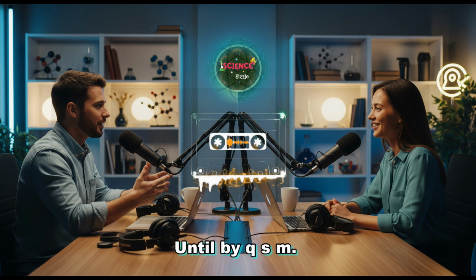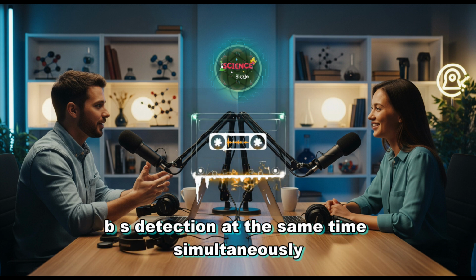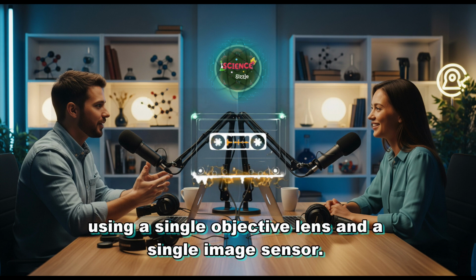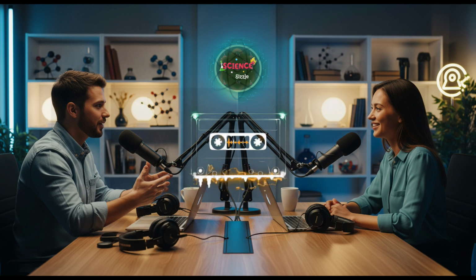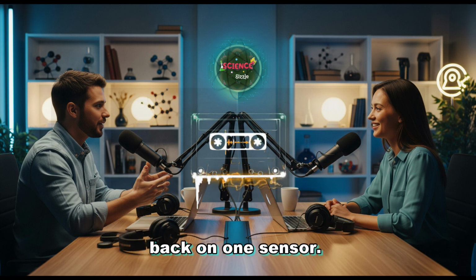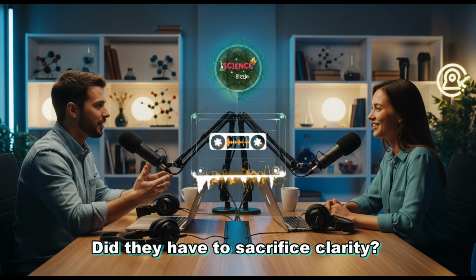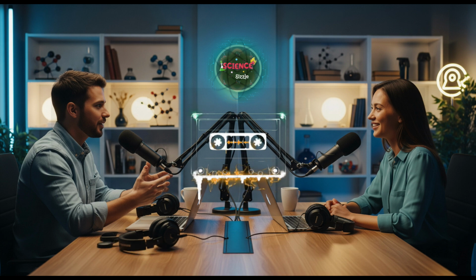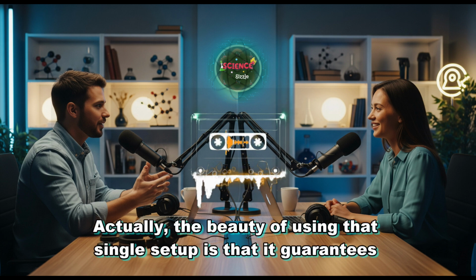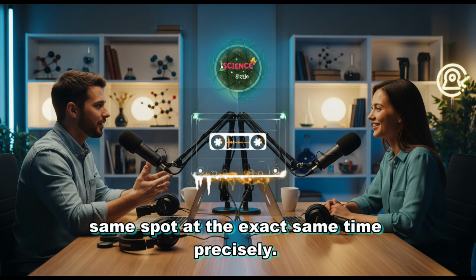Until BiQSM. The whole idea here is that it ends that rivalry by integrating both FS and BS detection at the same time, simultaneously, using a single objective lens and a single image sensor. But capturing light going in two opposite directions, forward and back, on one sensor, sounds like an alignment nightmare. Do they have to sacrifice clarity? You'd think so, but not at all. The beauty of using that single setup is that it guarantees spatiotemporal consistency, meaning you get two different images of the exact same spot at the exact same time.